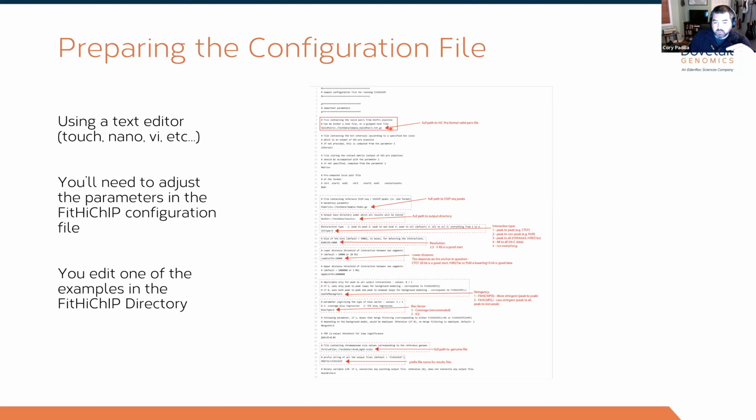Then what we want to do is feed in our ChIP-seq peaks. So here, peak file, that's the narrowPeak format, or just a 3-column bed if you have a consensus file of peaks that you want to ask that question about. Then we want to point to where the output directory goes.